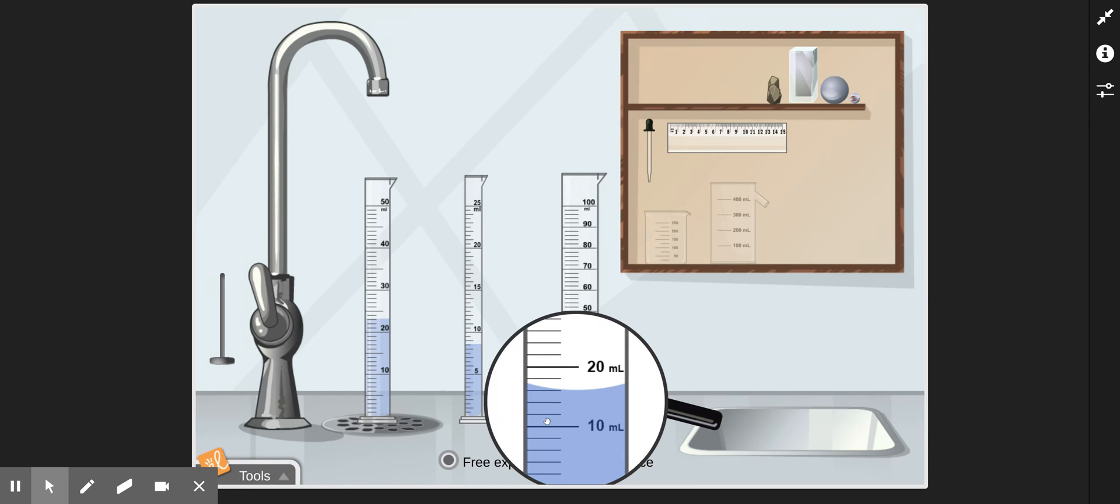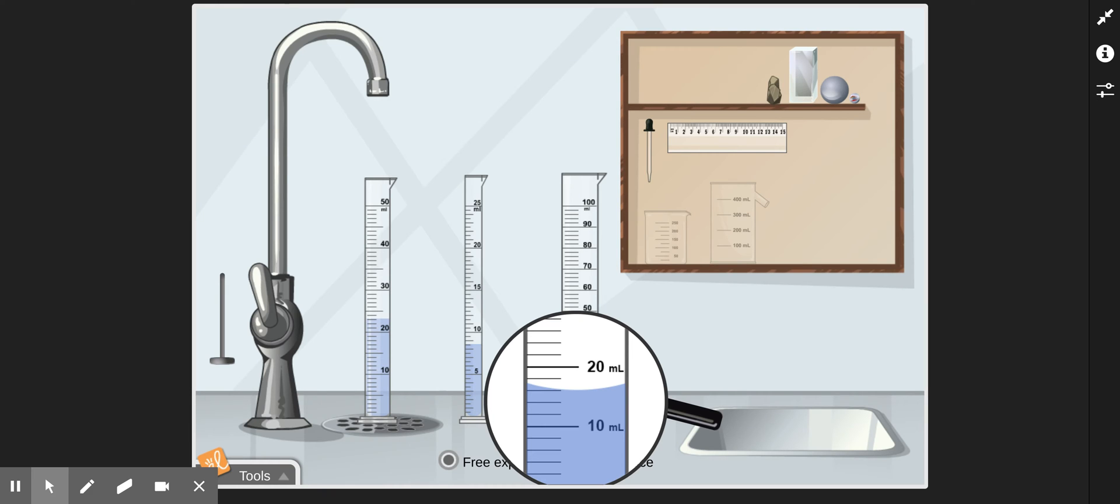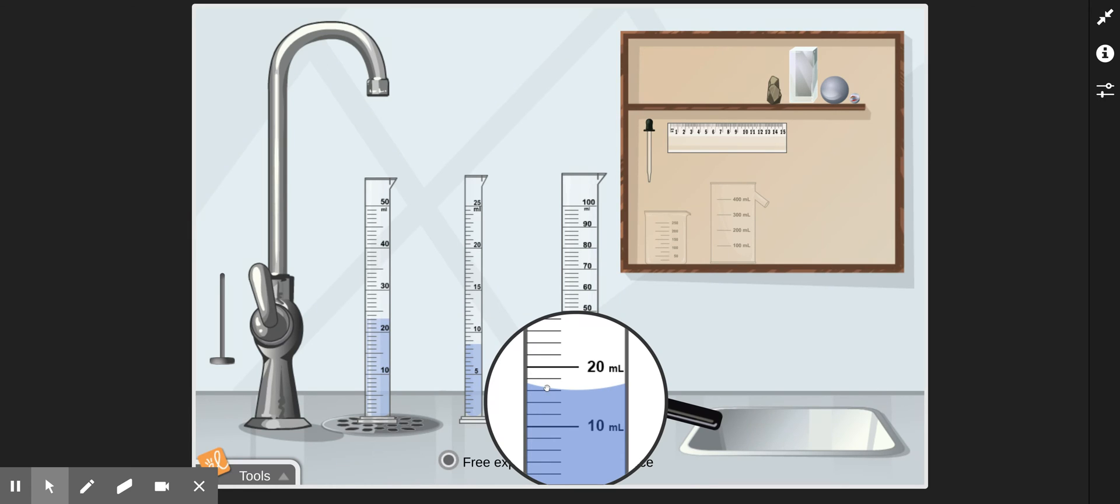The second step is to count the spaces between those two labeled lines. So we would have one, two, three, four, five spaces between the 10 milliliter and 20 milliliter. And then the third thing is to take the amount of change, that 10 milliliter change, and divide it by the number of spaces, which was five. And 10 divided by 5 is 2 milliliters, and that tells us that each line on this graduated cylinder represents 2 milliliters of volume. So we know we're over 10 milliliters, so then the next line would become 12, 14, 16. And that tells us we would have 16 milliliters of volume.